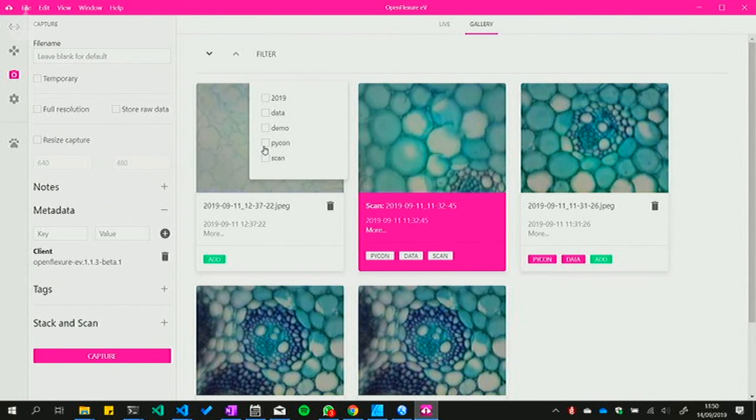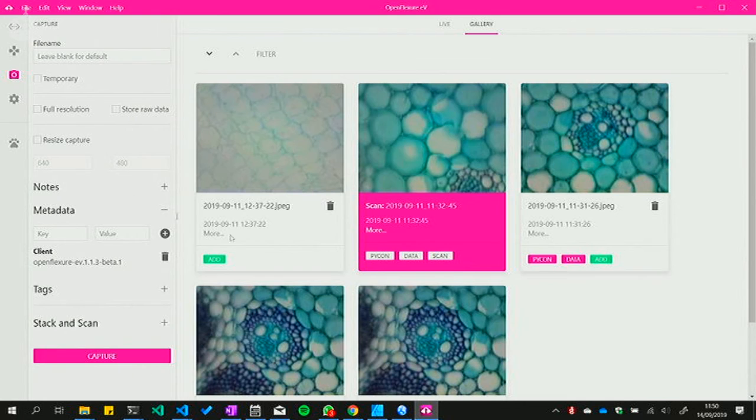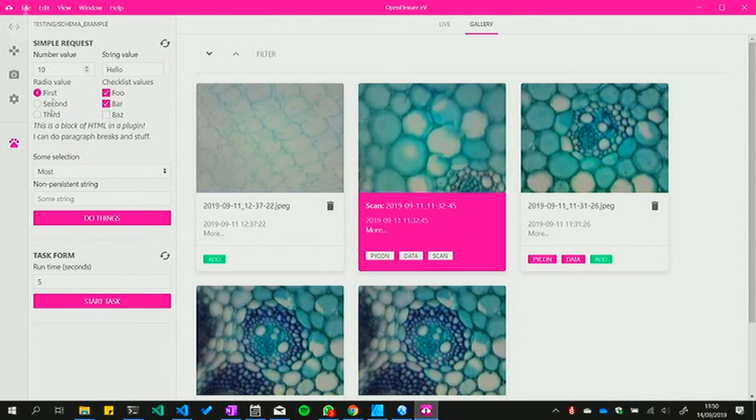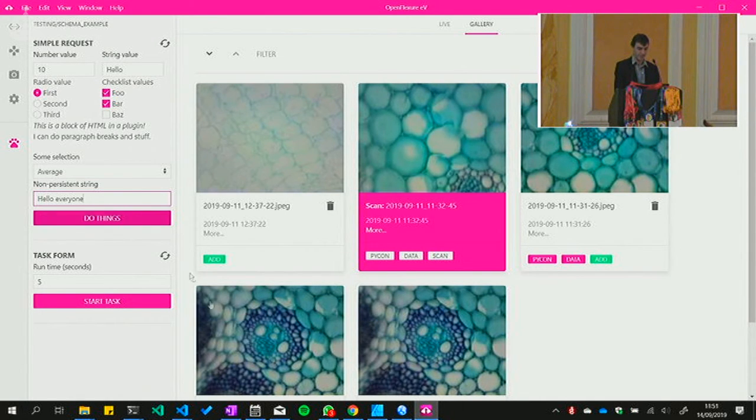To capture an image, just click capture — it shows up in your gallery. All data is stored on the Raspberry Pi but you can right-click to save the image with all its metadata to your device. There are basic metadata fields and additional tags you can filter by — for example, filter by 'pycon' to discover all images taken for PyCon. There's also a test plugin that automatically draws a UI with radio buttons, selection fields, and string inputs to show how the plugin UI system works.